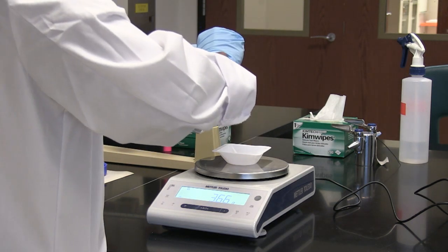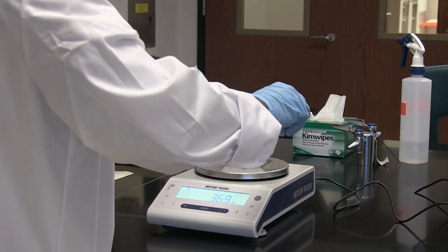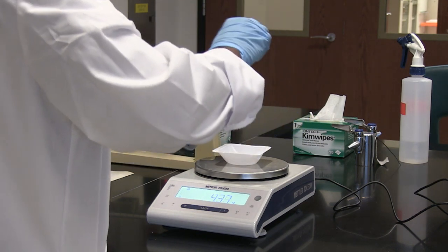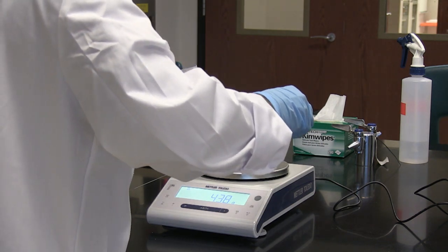So when I've added one gram, it's supposed to read 3.22 grams total, that would give me the weight of the weigh boat plus the salt.